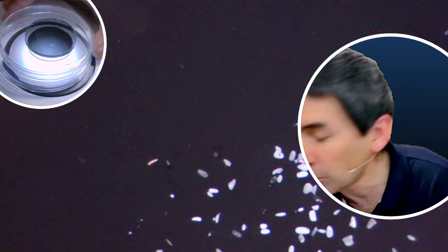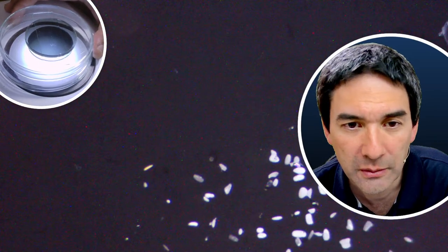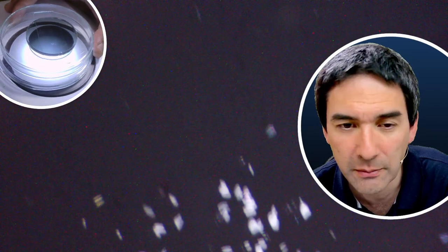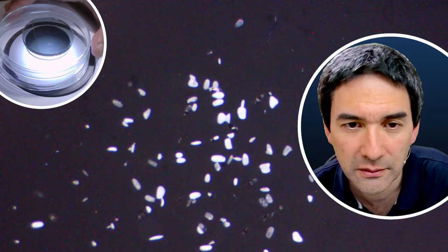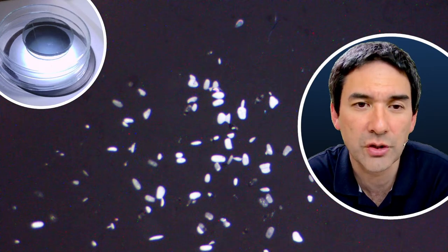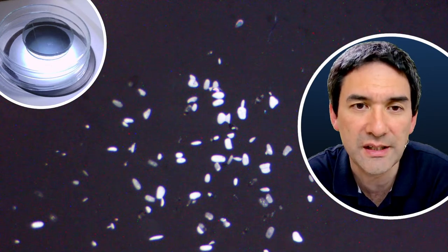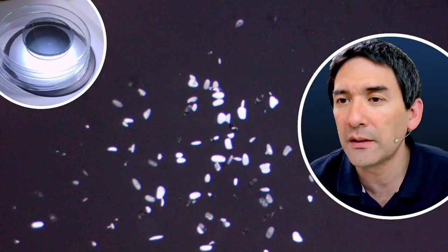Okay, but let's be again a little bit patient. I mean, I tried everything already out in the afternoon, and so I know that this should work, but it's maybe only a question of time. And I assume that maybe some of these crystals might actually act as crystallization seeds. So let's see how this works. Okay, so let's have again a look here.